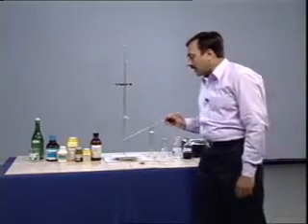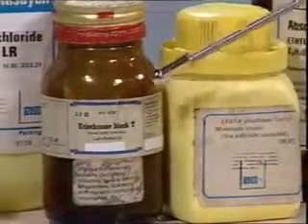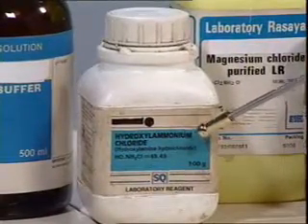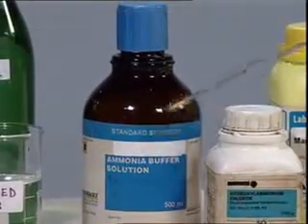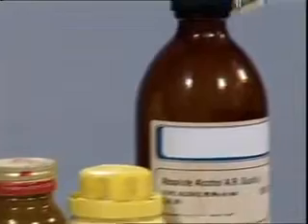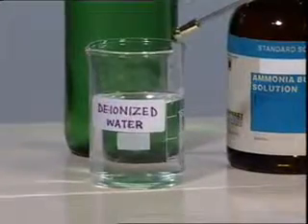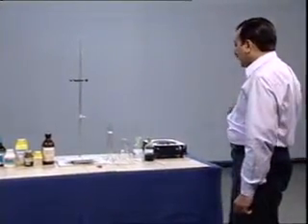The reagents required are sodium salt of EDTA, Eriochrome black T, hydroxylamine hydrochloride, ammonia buffer, magnesium chloride and 95% ethyl alcohol. We also need deionized water, and to boil water we shall require a hot plate.